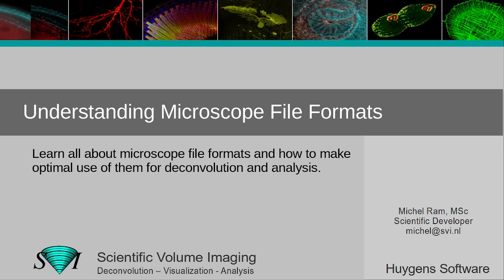My name is Michel and I'm a developer here at SVI, and the aim of this webinar is to describe how microscope images are stored after acquisition and to teach you about the differences in file formats to make sure you get the most out of your data for deconvolution and analysis.